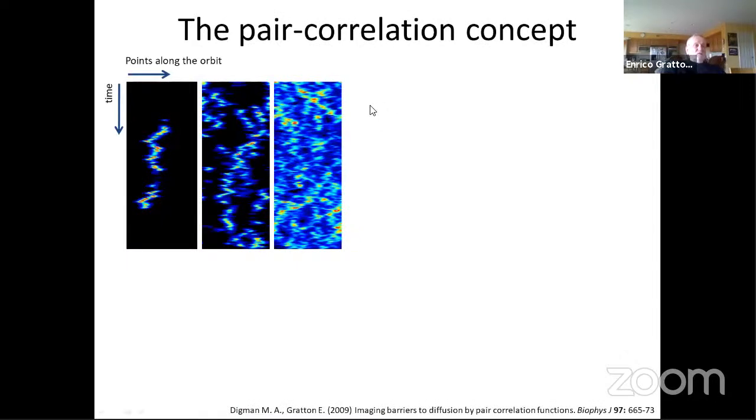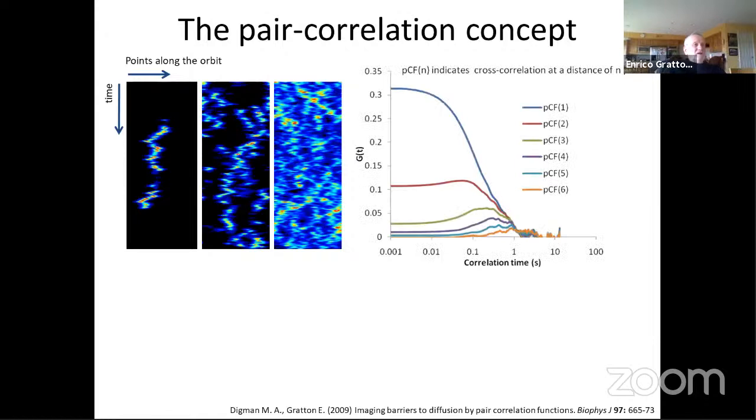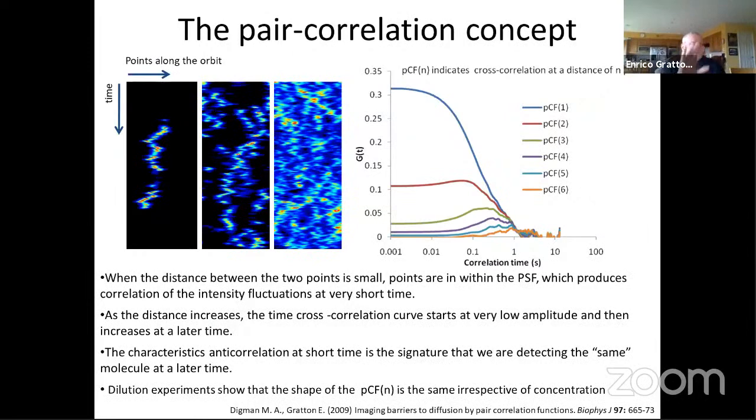So, let us do a simulation to show if my idea is correct. Here I simulate one particle, here I simulate two, here I simulate three, and so on. If I have only one particle, it can only be correlated with itself. If I have more than one particle, well, I will have different times. So let us see what is happening. If I do the correlation function of one particle, two or three or many, I always obtain the same result. And the result is the following. If I correlate at a distance of, for example, 1 pixel, because I need to index by 1 pixel, and as a function of time, I will obtain what is called a pair correlation function, which will be that blue line. And then as I go farther and farther, at the beginning, I will have no correlation, and then only when the particle appears at that coordinate, I will have some correlation. Of course, the intensity and the probability will go down because I'm only analyzing a line. If I analyze a space, it will be different, and I will discuss that in a minute.